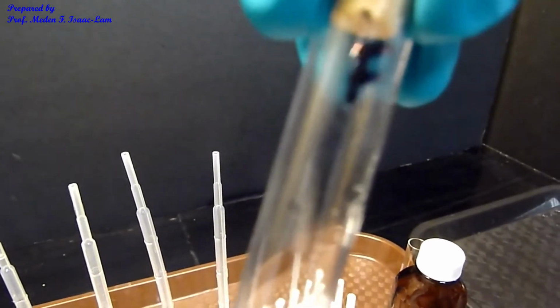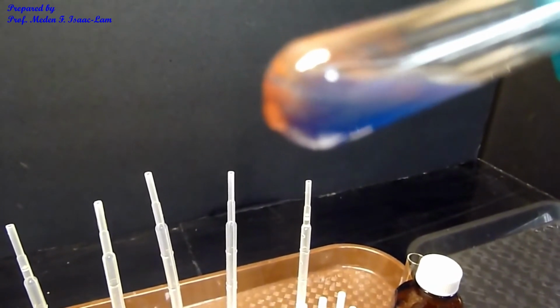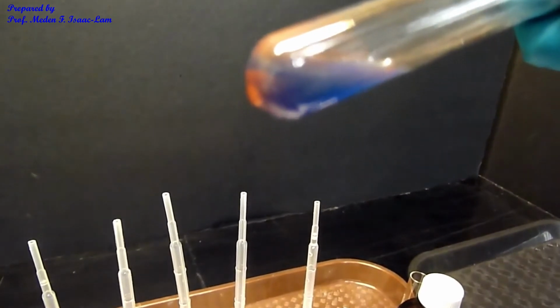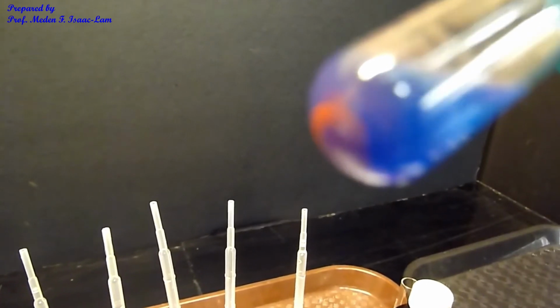So this is the unknown F. And you can see the precipitate if I tilt the tube. So you can see the precipitate actually at the bottom, which is reddish in color. So against the black background, you can see the top has a red precipitate of the copper(I). So that's F. And then the same thing for the anisaldehyde, you can see that red coloration at the bottom.